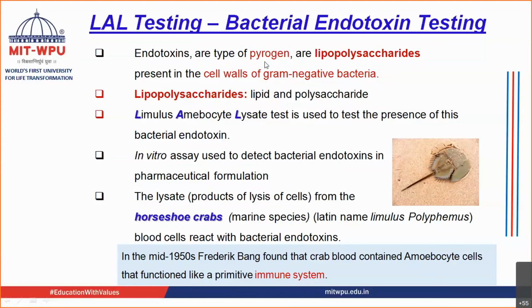Pyrogens are agents which cause a rise in body temperature. What do we mean by lipopolysaccharides? Lipopolysaccharides are a combination of lipids and polysaccharides.